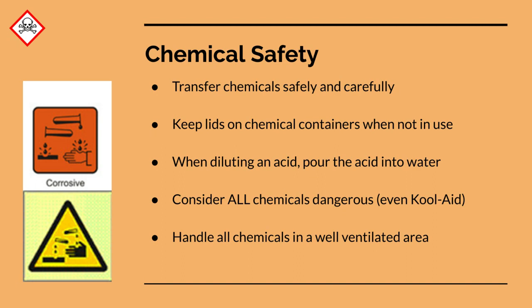So consider all chemicals dangerous. Again, even Kool-Aid. Handle all chemicals in a well-ventilated area. I've got a fume hood in here if we ever need to use it, which it's possible that we do. We'll see how this year goes. But I do have a fume hood that we'll be able to use. If you're working at home, obviously, with any kind of material that may smell or may have fumes being produced, you should be in a well-ventilated place, meaning you've got a fan going, a window open, and that you're not enclosed in a room that doesn't have any air leaving it. Okay.